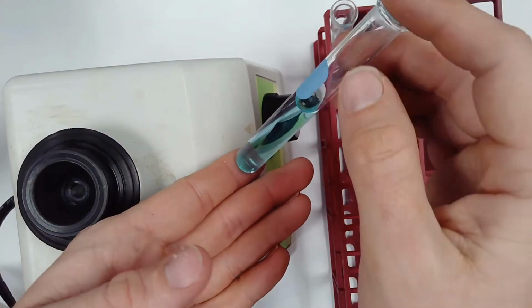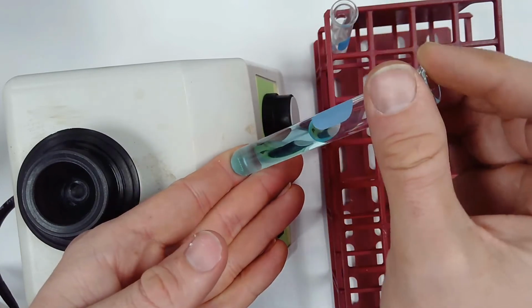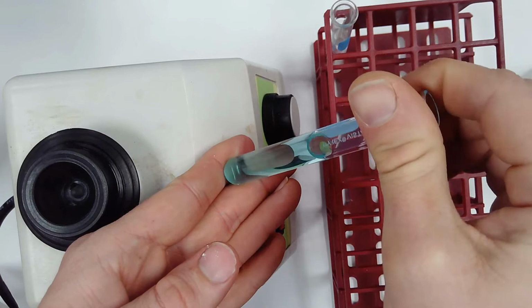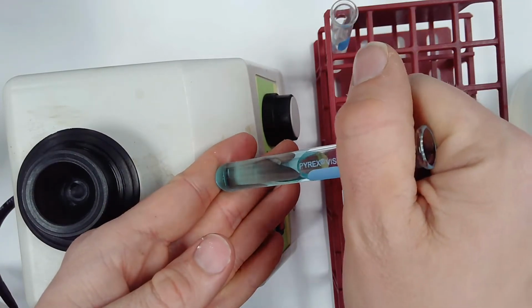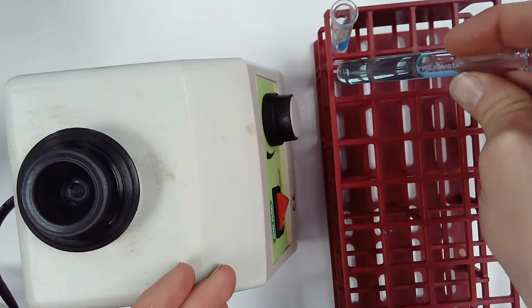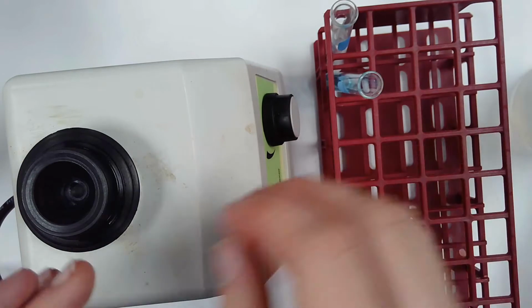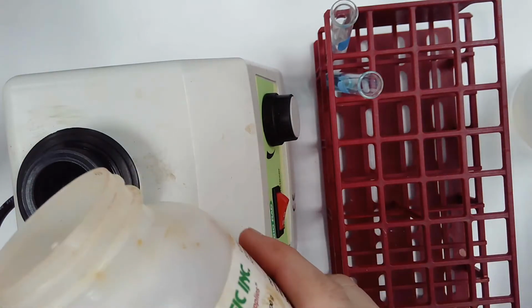So while we're here, this is the copper sulfate solution. I want you to notice its color. This might be the first time you've actually seen a copper solution. So all copper solutions in a chemistry lab, or at least many of them, take on what color? All right, I'm going to restart the time lapse here in just a second, but all copper tends to be blue. Let's go ahead and do the iron nitrate next, though, in this time lapse.